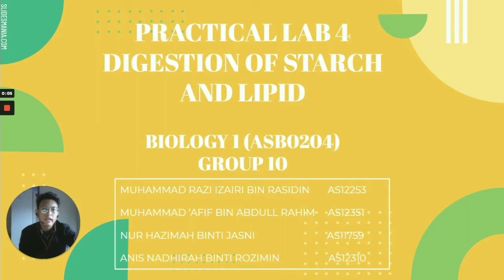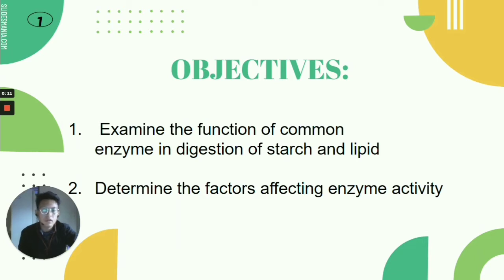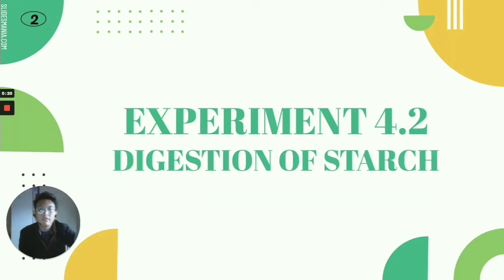I'm from Group 10 and now I will tell about the practical lab for digestion of starch and lipid. For the objective, we examine the function of common enzymes in the digestion of starch and lipid. And the second objective is we determine the factors affecting enzyme activities.